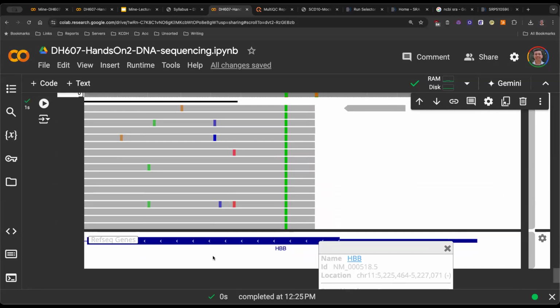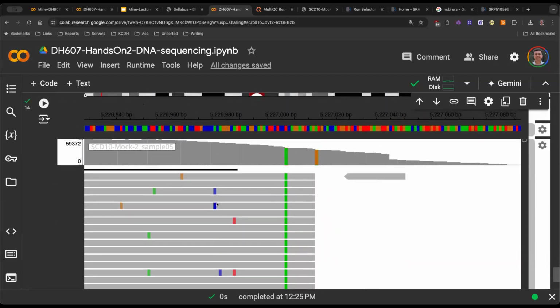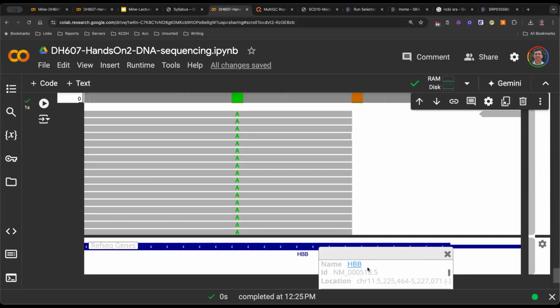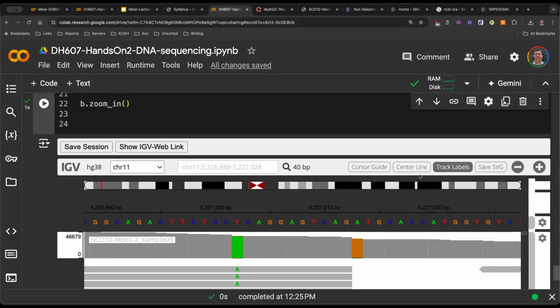What is this color here? Why is this colored, and why is everything else gray? And then life becomes green somewhere. What is going on? Why green?